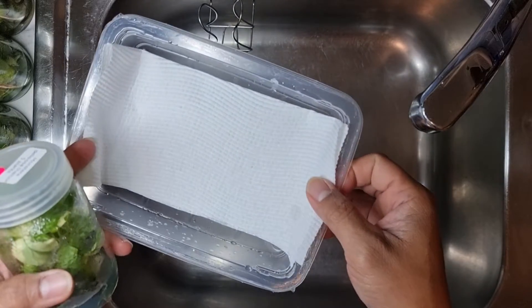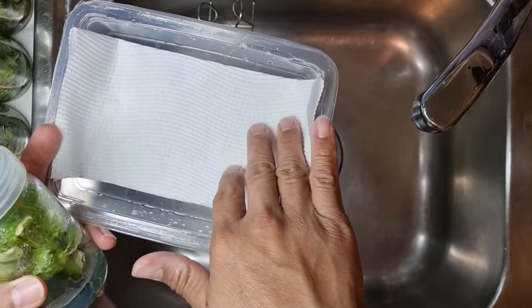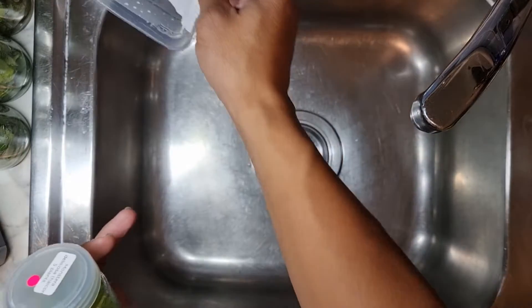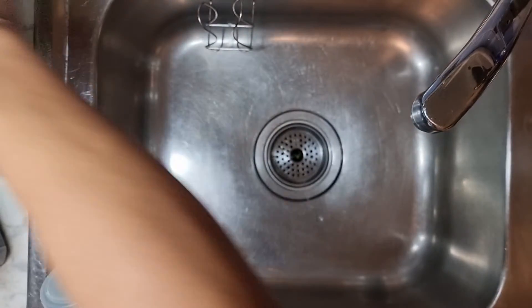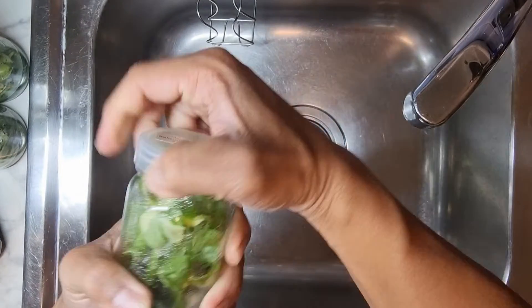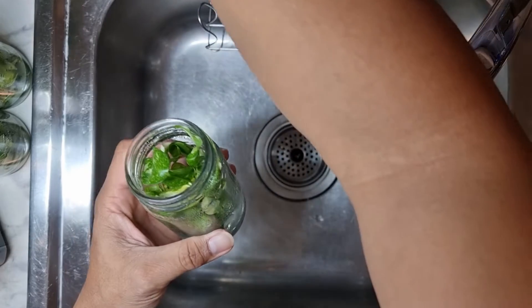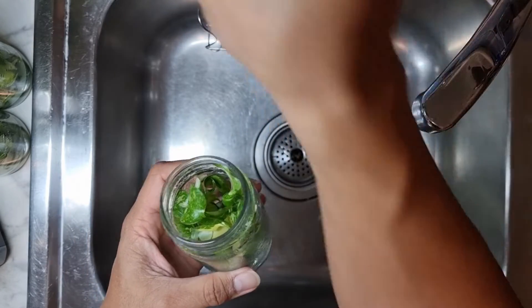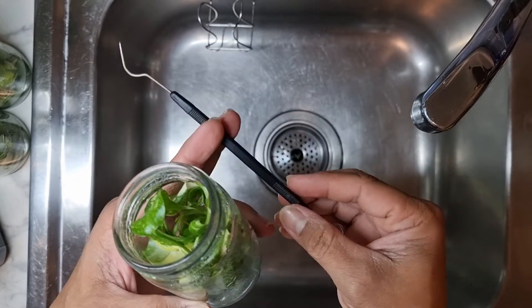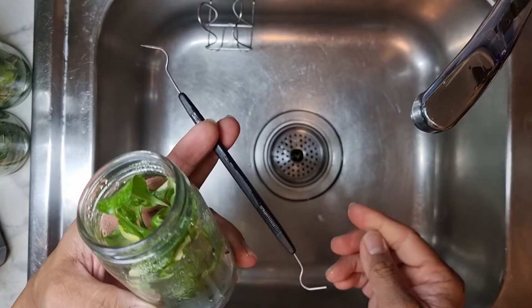We have our tray where we put the plantlets after cleaning them. I like lining the bottom with a clean paper. Pop it open - a lot of plants in there, just need to be careful pulling them out. I like using this metal hook that I got from the hardware store.